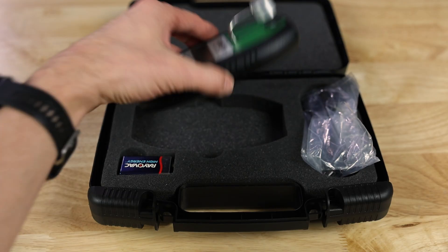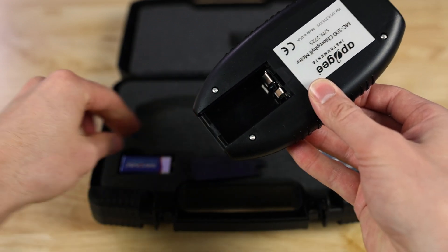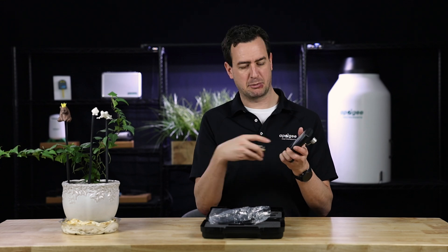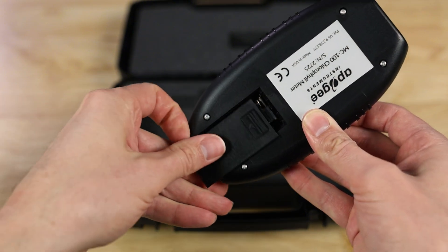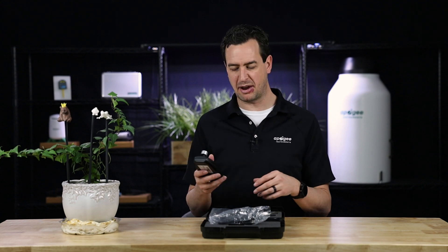Pull the meter out of the box and take the cover off the back by pushing it down and sliding it down. Take the battery and place the large terminal on the large pad and the small terminal on the small pad — stick the bottom in first and push it in. Put the cover back on and slide it up to lock it in place. It should turn on automatically; if it doesn't, press the power button in the bottom right corner.